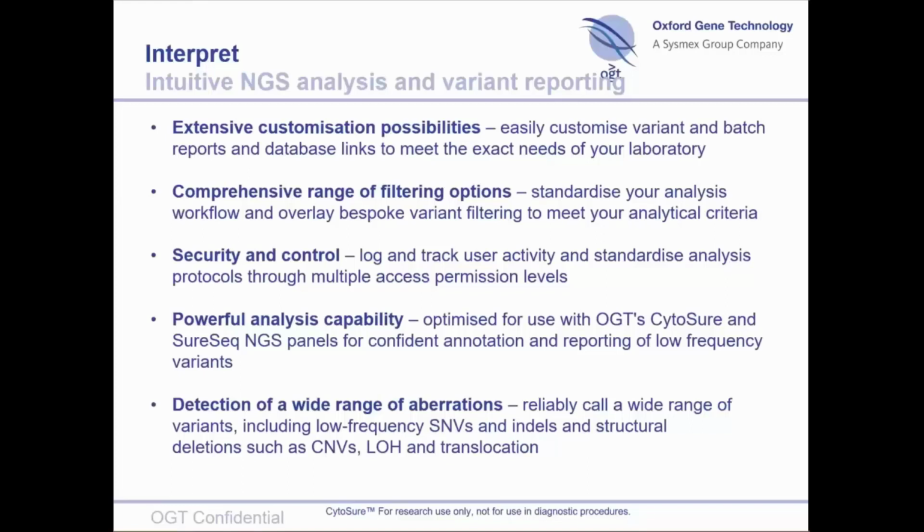And at the back end, we have a relational database which will store all the activities conducted by the software, so all results and variant calls are retained within the database. This enables logging and tracking of individual user activity for consistent data processing and laboratory monitoring. And we can also use the database to implement security protocols such as access permissions to different parts of the software.